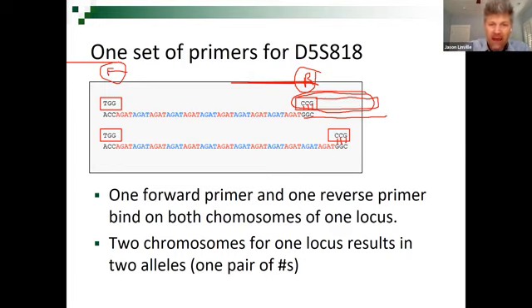Then amplification will occur. So when you choose 2 primers that are 15 base pairs long, the commercial companies actually do the research and development to make sure they are only going to attach next to each other at one location in the genome.